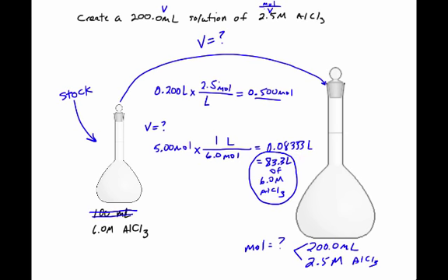So what that means is I need to pour into my container here 83.3 milliliters. Okay, when I do that, that'd probably be a little bit higher, wouldn't it? Okay, let's move it up a little bit. Okay, let's just say it would be like right around here. Okay, so this would be my 83.3 milliliters.